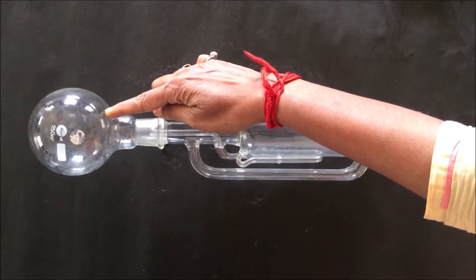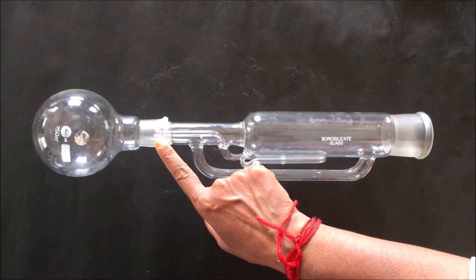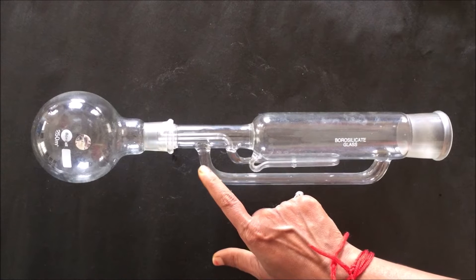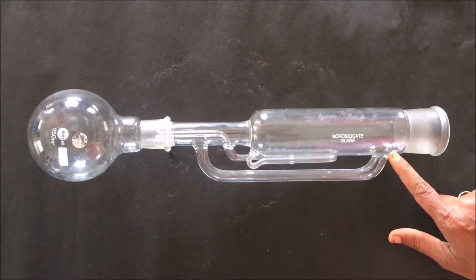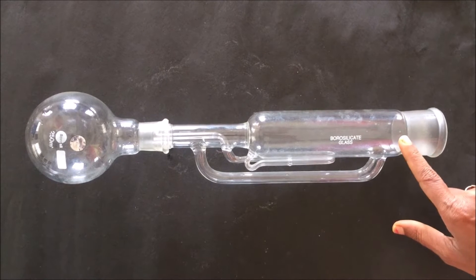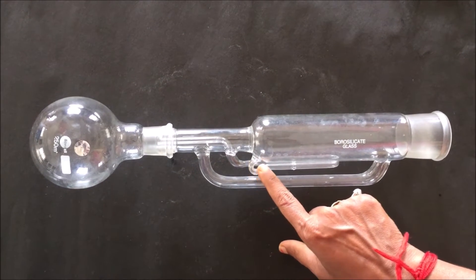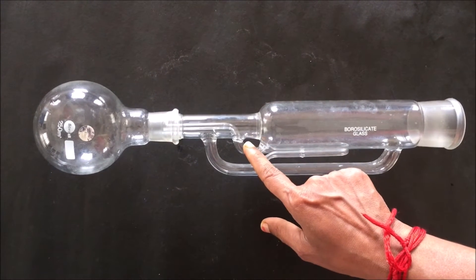The solvent present in the round bottom flask, when heated during extraction, boils and gets converted into vapor. This vapor rises up through the vapor tube — this is called the vapor tube — and further rises up towards the condenser. This is the point where we attach the condenser. Inside the chamber we pack the powder drug material to be extracted. This is the siphon tube, which carries the solvent containing the extracted chemical of the drug from the chamber back to the round bottom flask.